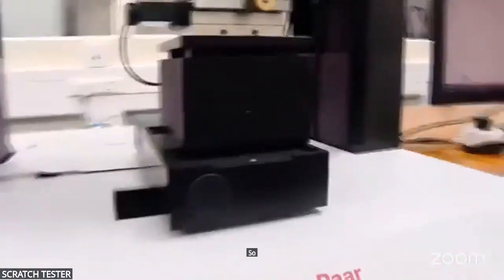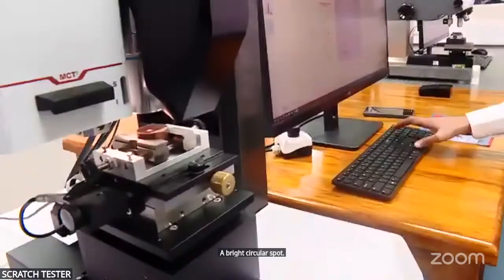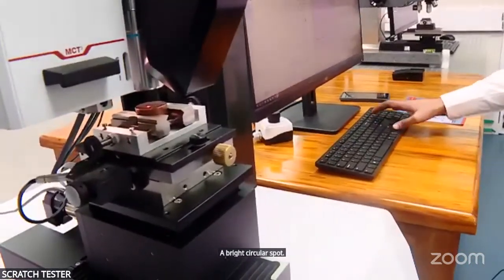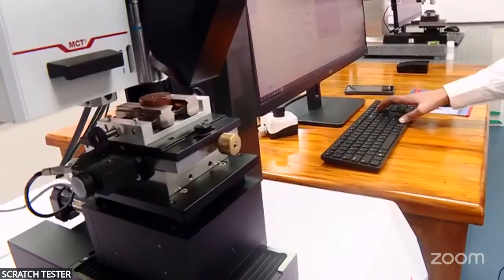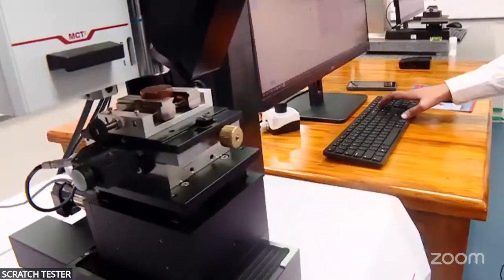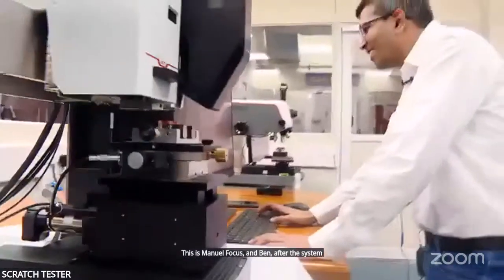For autofocus, first we have to find a good, bright circular spot. This is manual focus, and after that the system will do automatic focus.